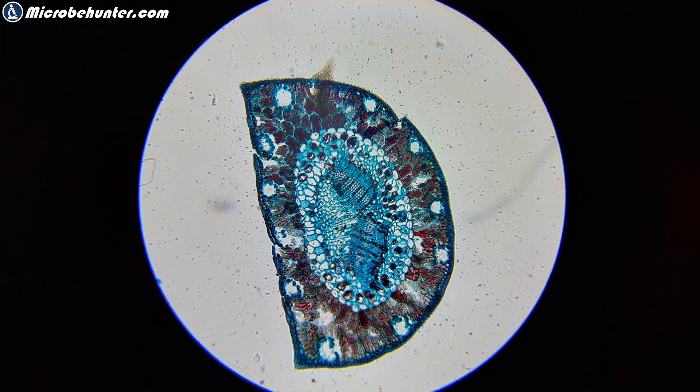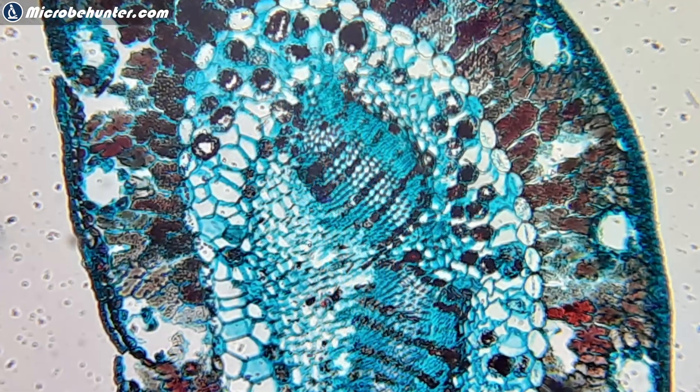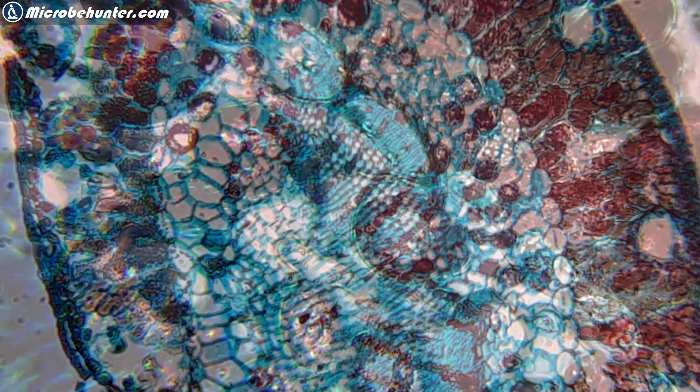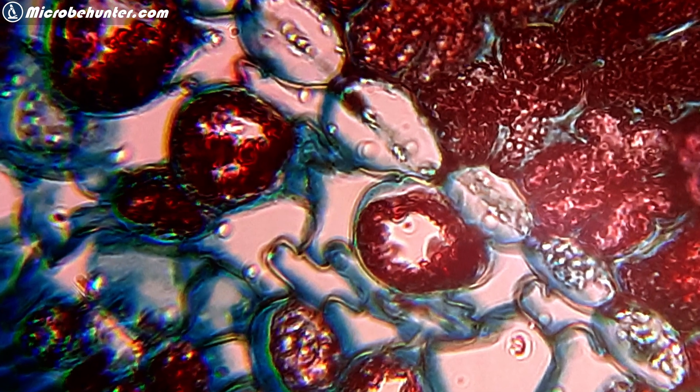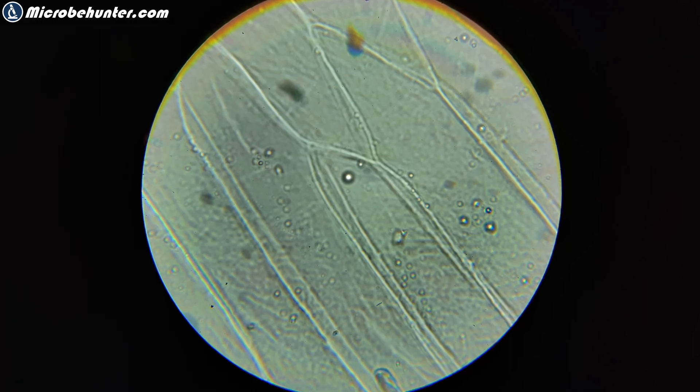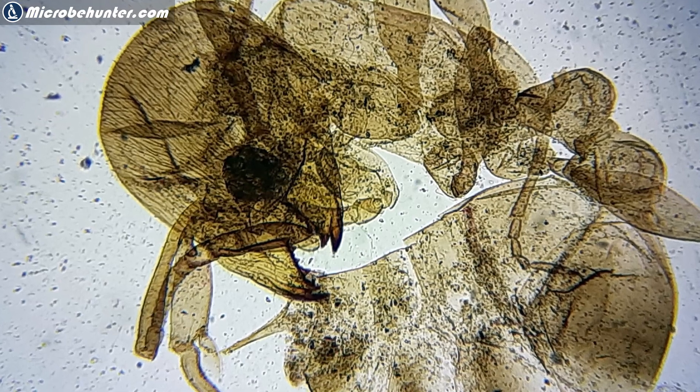This is a pine leaf cross section that I took directly through the microscope. And you can see it looks quite nice. The individual cells are visible here at a higher magnification again. So it's quite nice what you're able to see. This one was not one of the slides. This is one that I made. These are onion cells. And there is also an ant. That's also quite nice looking here.